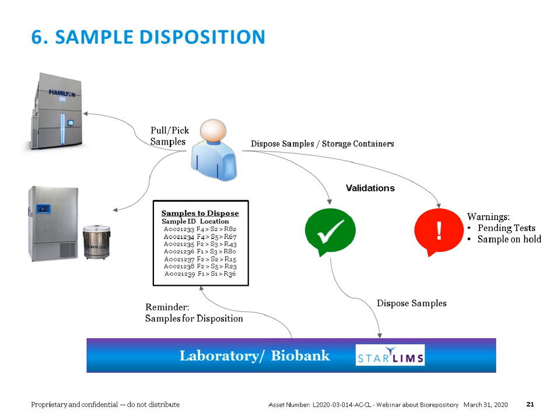And in any of these cases, the LIMS should be able to give you a report of samples that are ready to be disposed. And it's not just enough to tell these are the samples, but also the locations where they are. So then a very similar process to the packing needs to be done. The user needs to go to these different storage locations and pick up the samples that are ready to be disposed. This is something that the LIMS should be able to provide to the user.